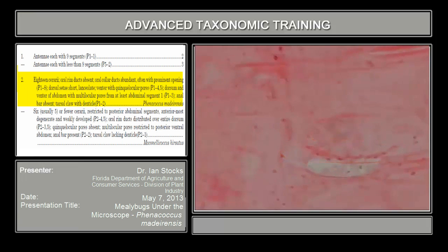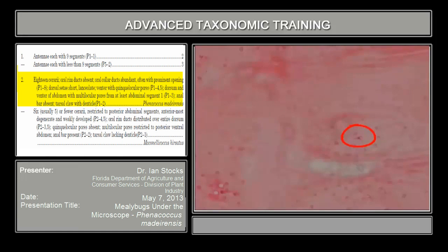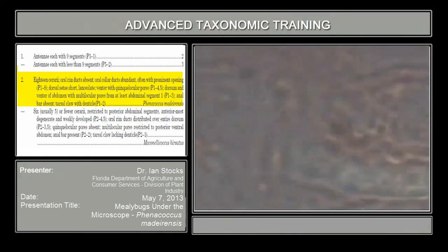And in reality, it's sort of a protrusion, a paired protrusion on the dorsum of the body that has a concentration of pores, the trilocular type, and is a little bit more sclerotized. So they're another good landmark character for regional morphology. Going back to our setae now, if we actually look here on the ostiole, right there is the seta that we're looking for. Now I'm going to try to go up to 400x here.